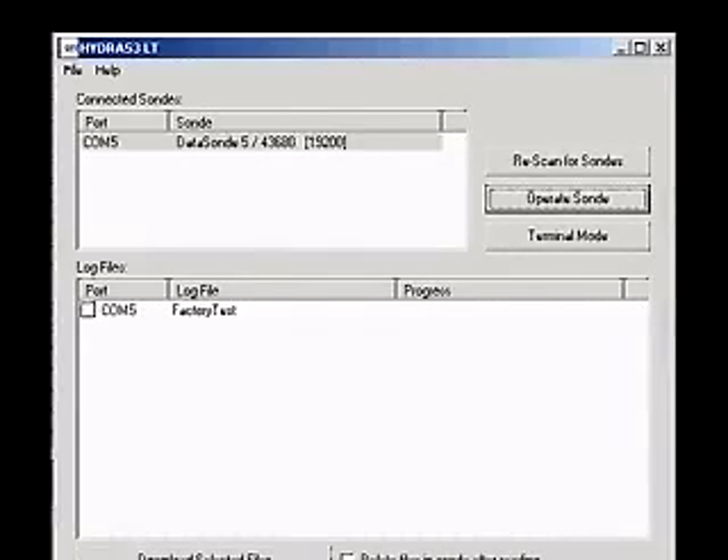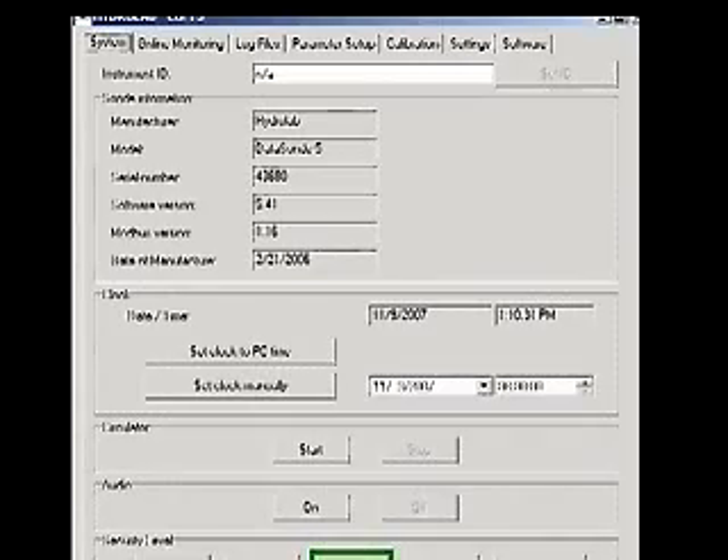Establish a connection to Hydrus 3LT and click the Operate Sonde button. Wait for the sensors to initialize — less than one minute.